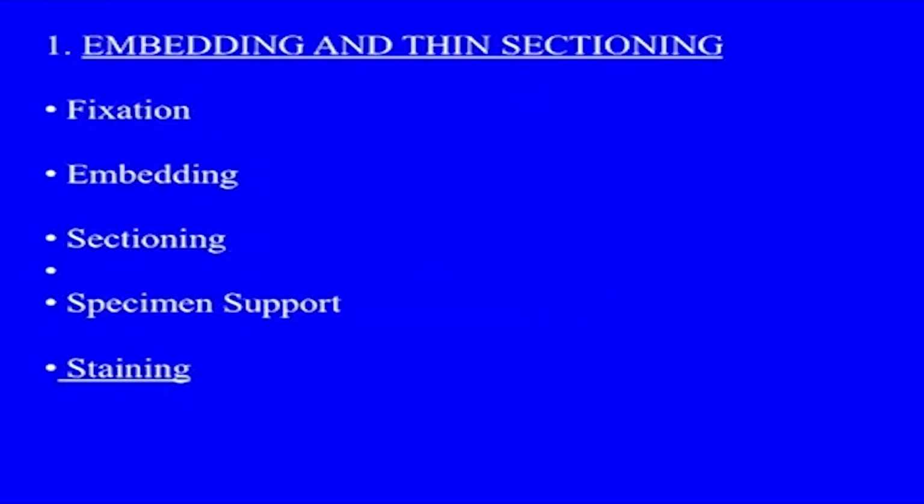Now, after fixation, many times samples may be treated with solutions of heavy metals. This is not staining as such, you are trying to provide more and more atomic density for scattering, and this is not compulsory here. Uranyl acetate and lead aspartate plus bismuth subnitrate can be used as block staining reagents here. So, after fixation, the embedding is done.